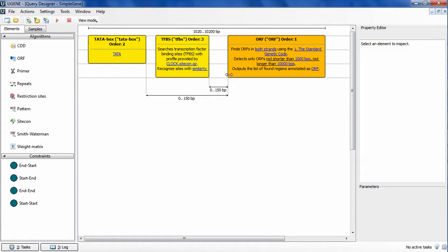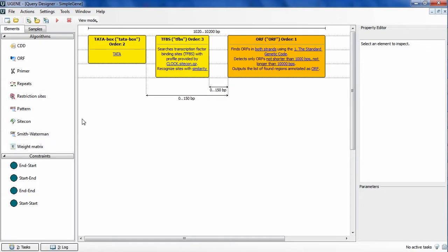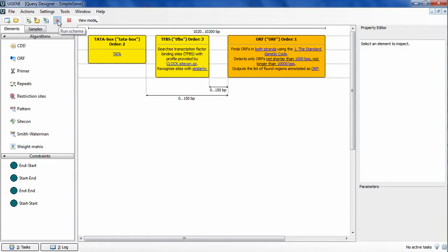It combines work of different sequence analysis algorithms into groups that match a specific pattern or query, and rejects all other results that do not match the query. You can create and run schemas of such queries with Query Designer, and you combine search algorithms work by imposing constraints on distances between the search results.